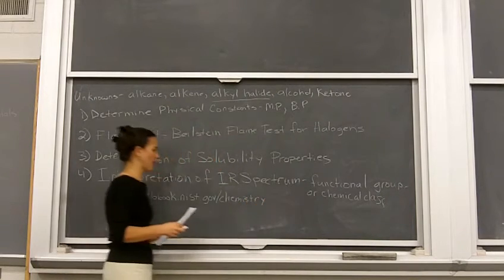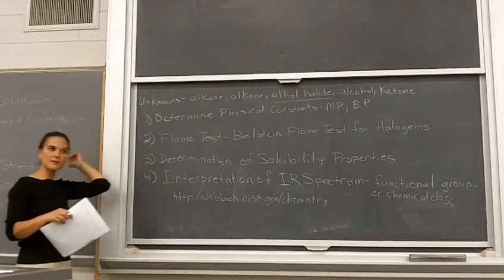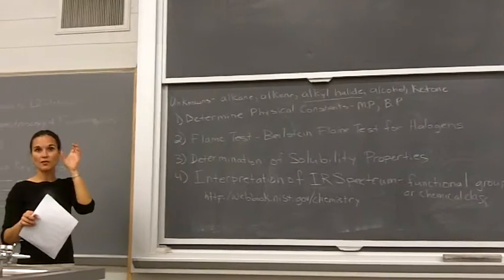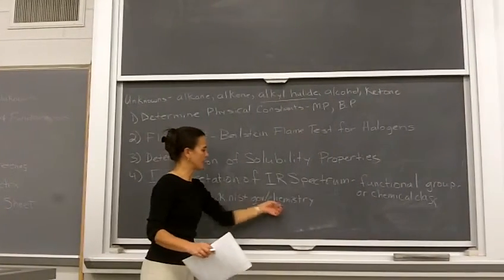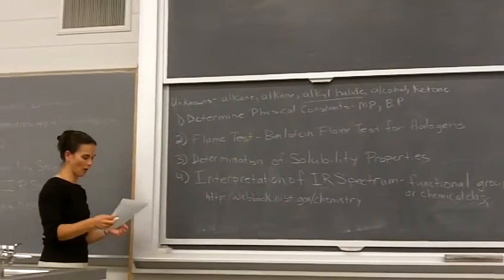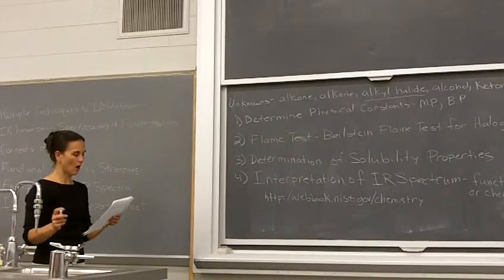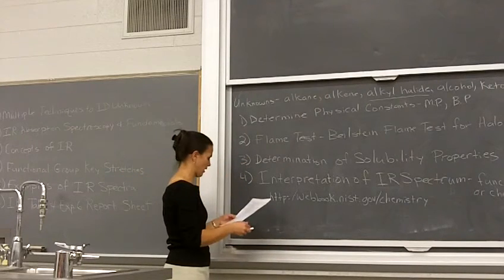You can also look up IR spectra there. However, Aldrich Spectral Viewer and SDBS are going to have ways for you to look up the specific frequencies for the spectra. This one does not print them with the frequencies on it, okay? So I tried the other 2 options first, all right? And in a little bit here, we're going to talk more about what you're looking at with the IR spectra.